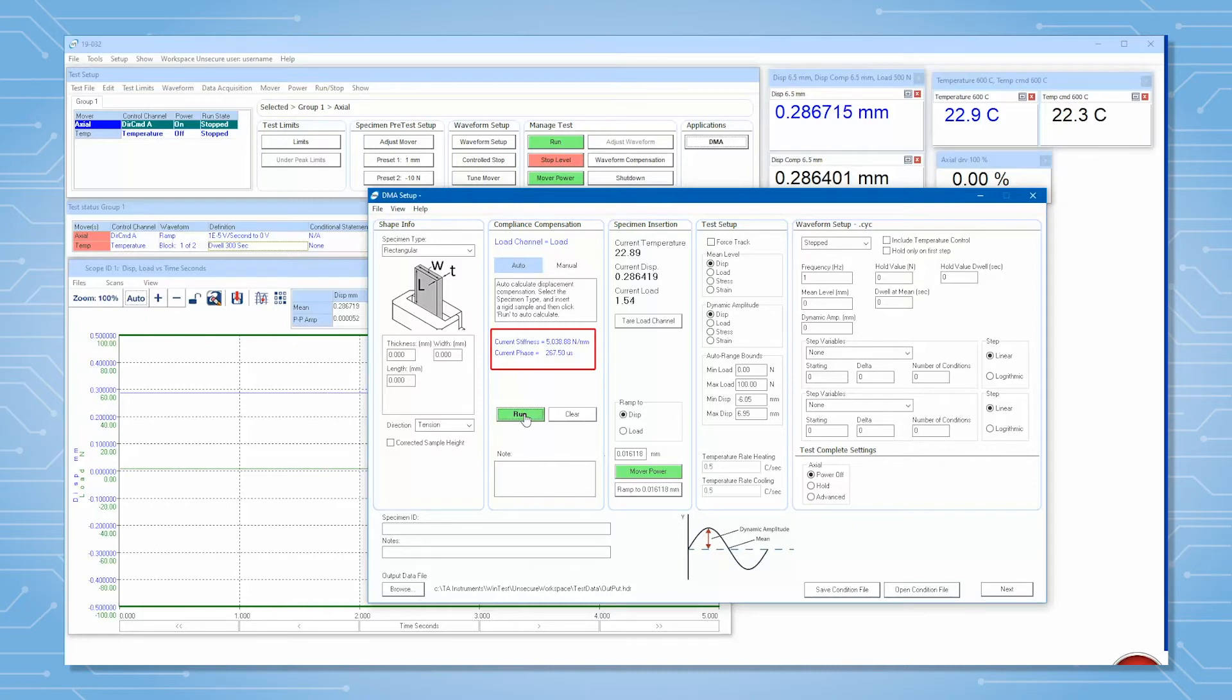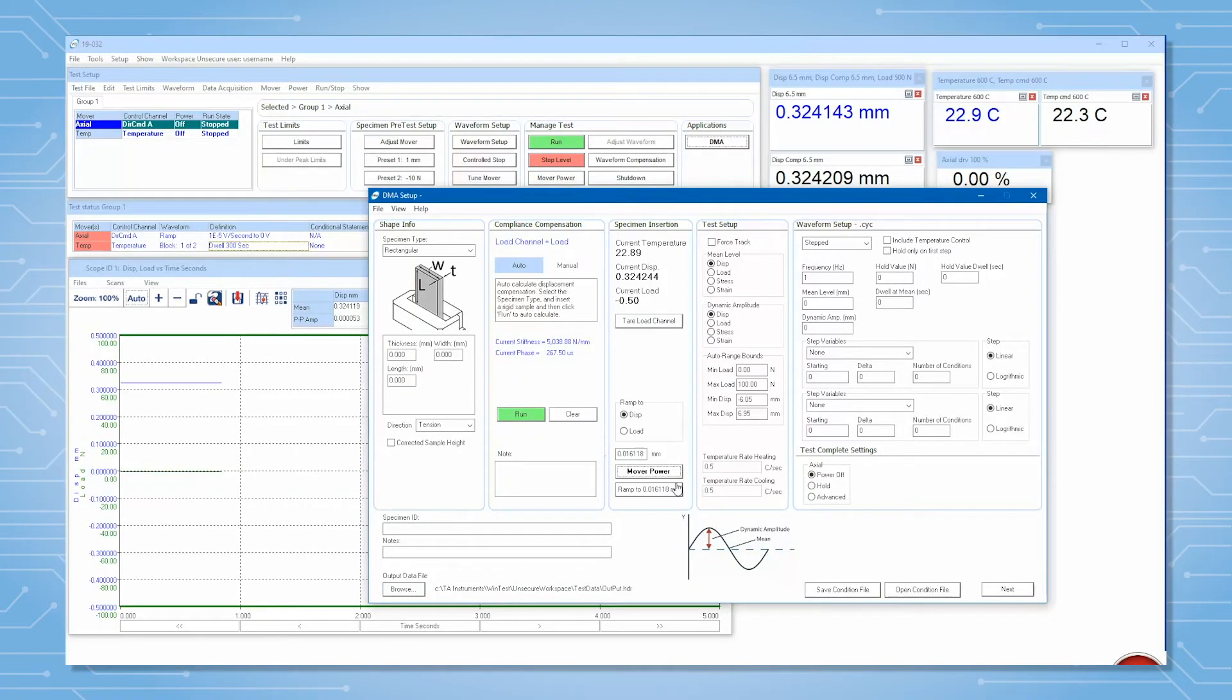For more information on this feature, you can watch the compliance compensation tech tip linked below. A third step is setting the corrected sample height. This feature is only used when testing in tension or compression geometries. Alternatively, you can measure all sample dimensions yourself with a caliper.